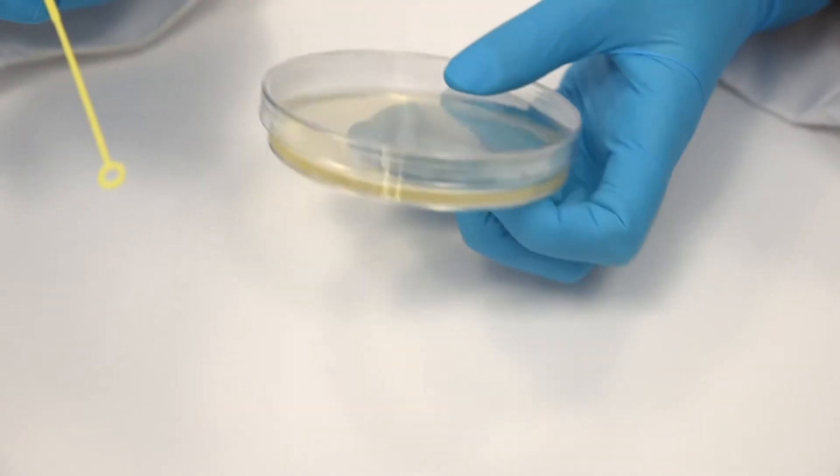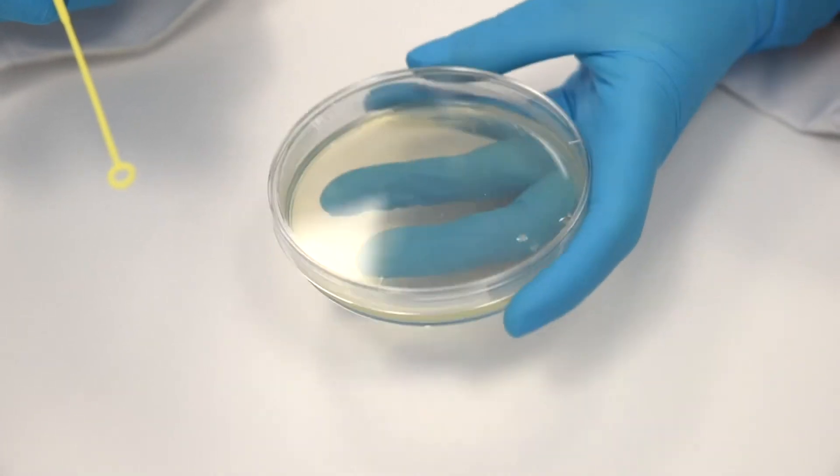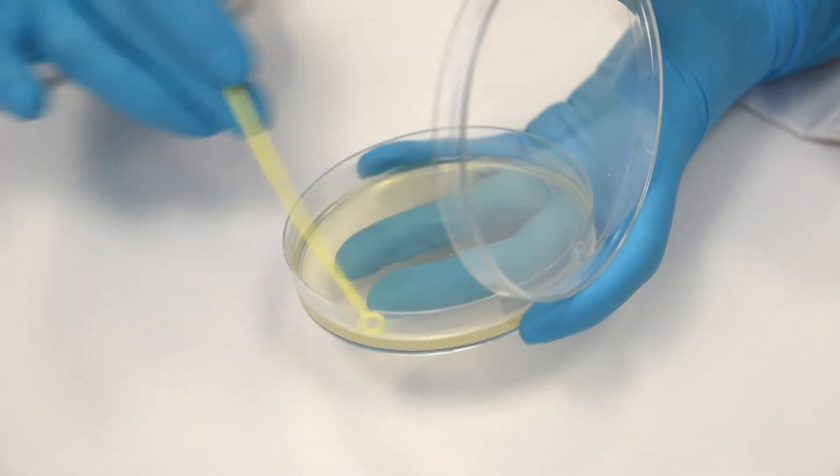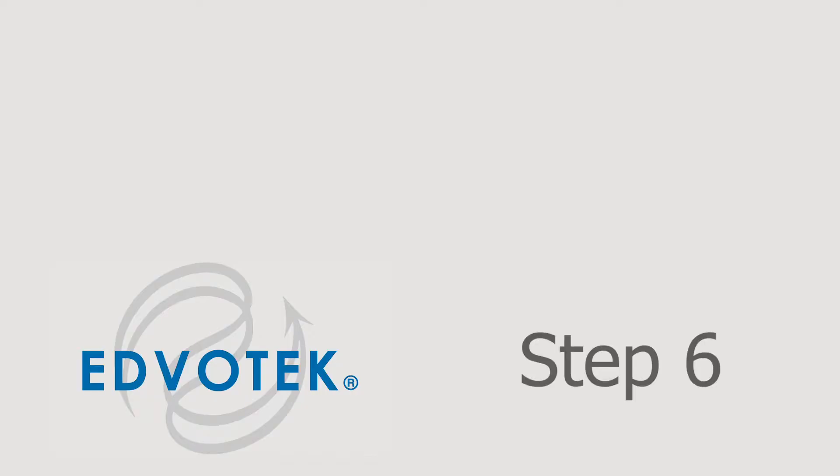Step 5: Rotate the plate, then streak the loop through the secondary streak to a clean part of the agar several times. Step 6: Rotate the plate once more, then streak the loop through the third streak to a clean part of the agar.